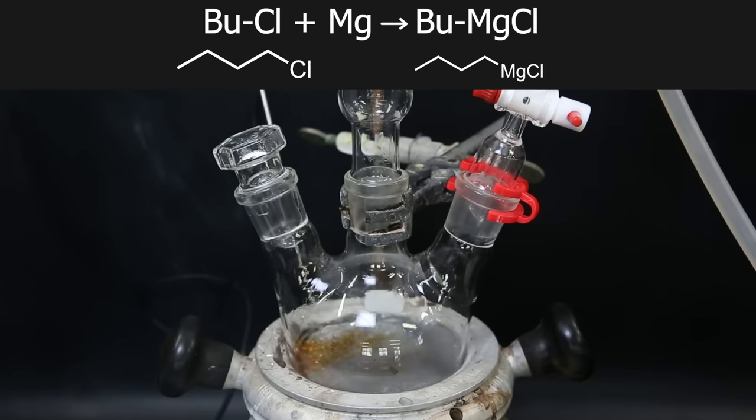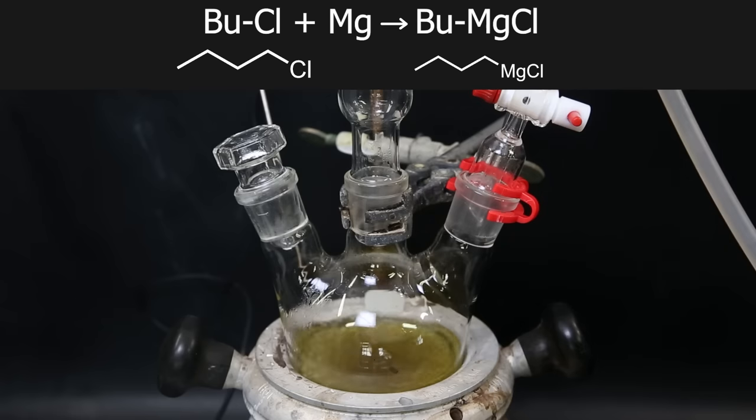In this reaction, the Grignard reagent is prepared. The magnesium will react with the 1-chlorobutane to form the Grignard reagent butyl magnesium chloride.